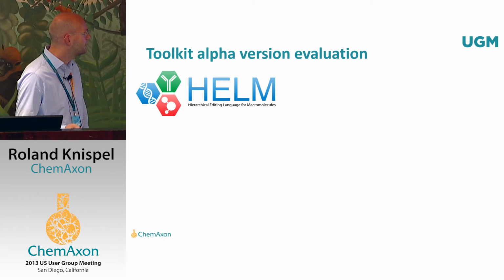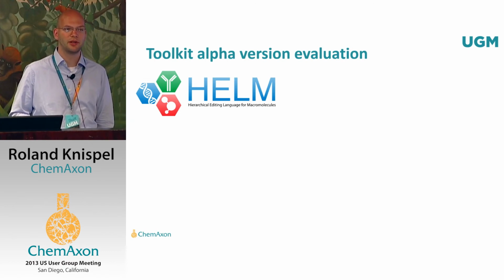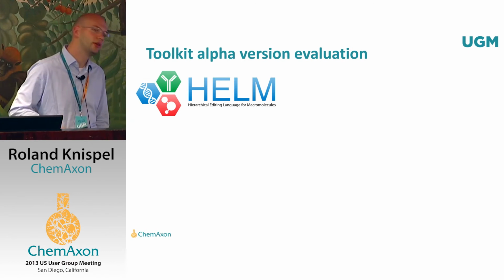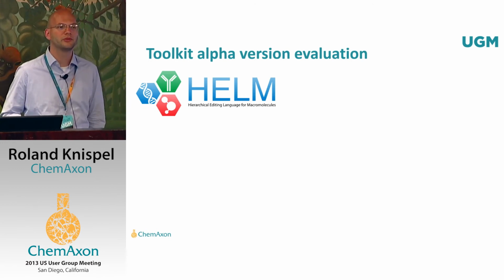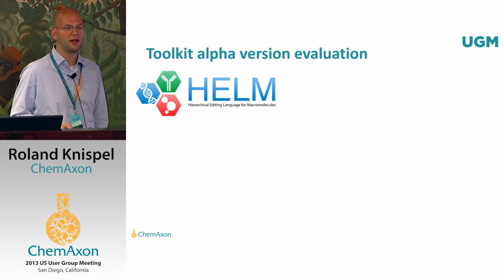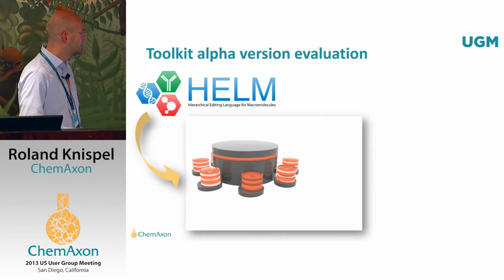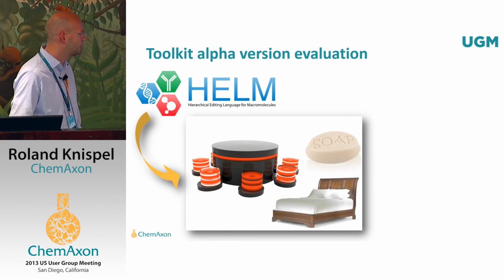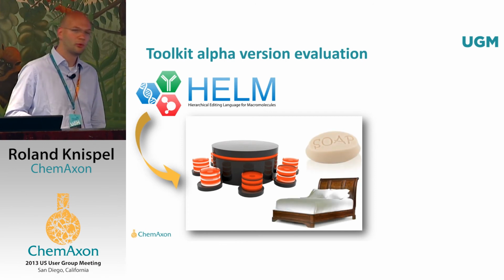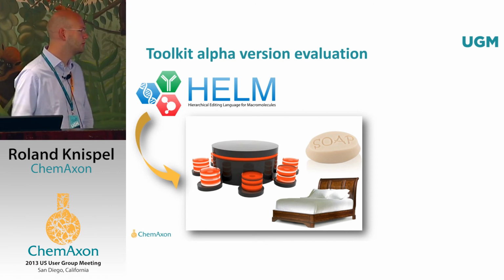Okay, so what do we have now? We have an evaluation version ready at the moment. We, in fact, have implemented a small demo site on ChemAxon.com. If you're interested in using this, then please contact me, since we have put a little password authentication on it. I would like to really encourage you to talk with me because I want to know what you're looking for. The toolkit comprises the database with some auxiliary services. We actually support both SOAP and RESTful web services, so it's no issue switching between the two of them.